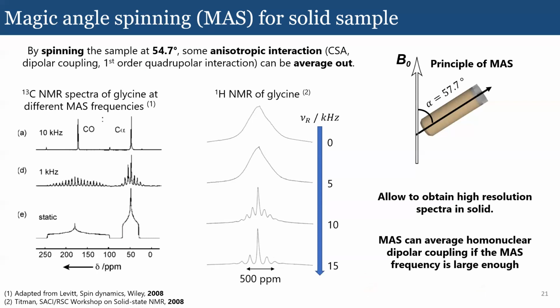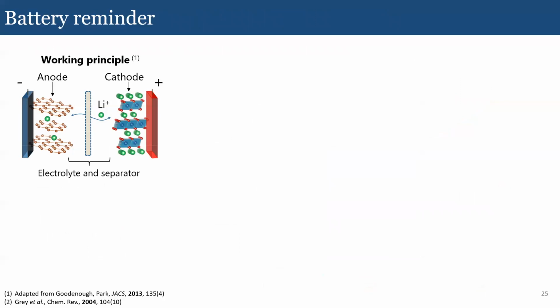But yeah, this is important. So now I'm going to move on to the actual reason why you are here, the NMR of batteries. Before doing that, maybe I should ask, do you have any questions, or is something not clear?